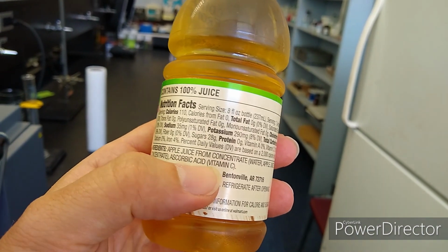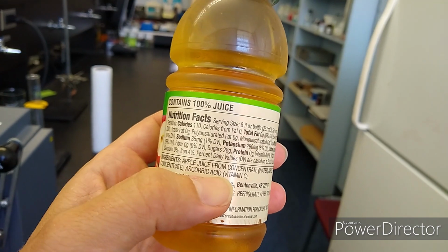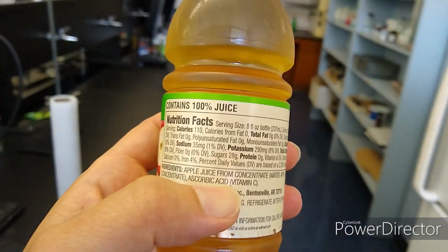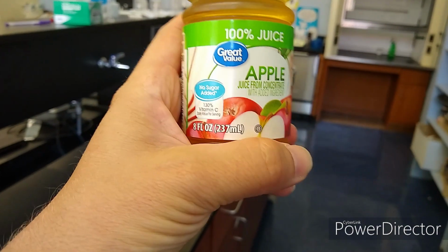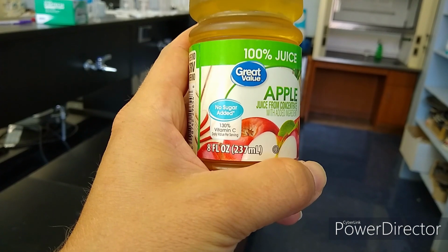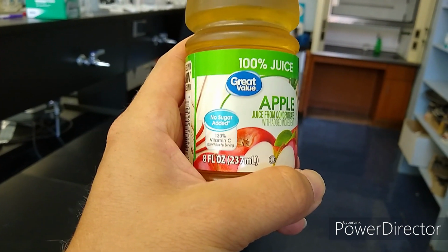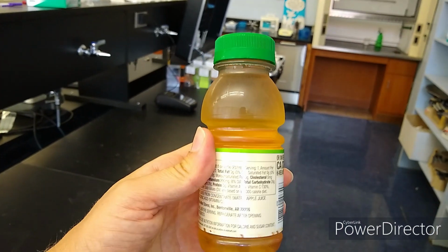Ascorbic acid, which is commonly called vitamin C. That's what we're trying to measure, how much ascorbic acid is in this bottle of juice. It says 130% vitamin C daily value per serving. That's a lot of ascorbic acid in this one little bottle.